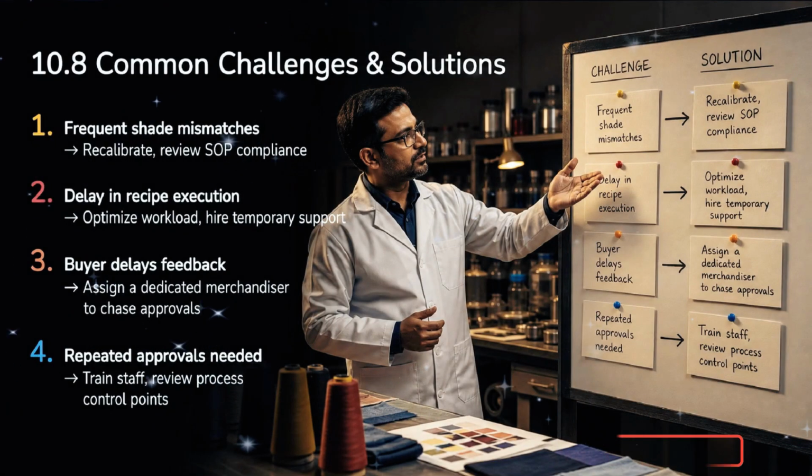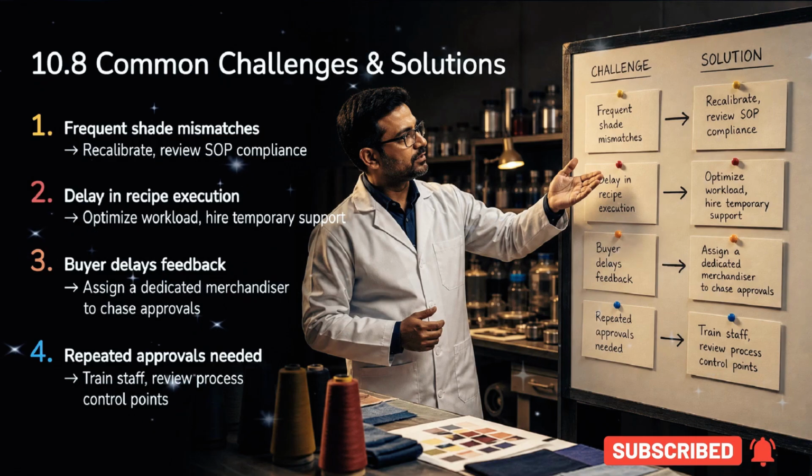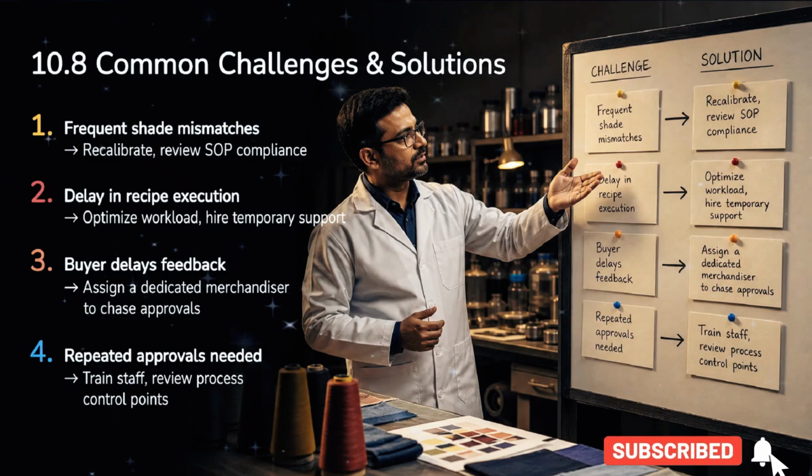Common challenges include shade mismatches, recipe delays, or slow buyer feedback. Address these by recalibrating instruments, optimizing workloads, assigning dedicated staff to chase approvals, or further training your team.